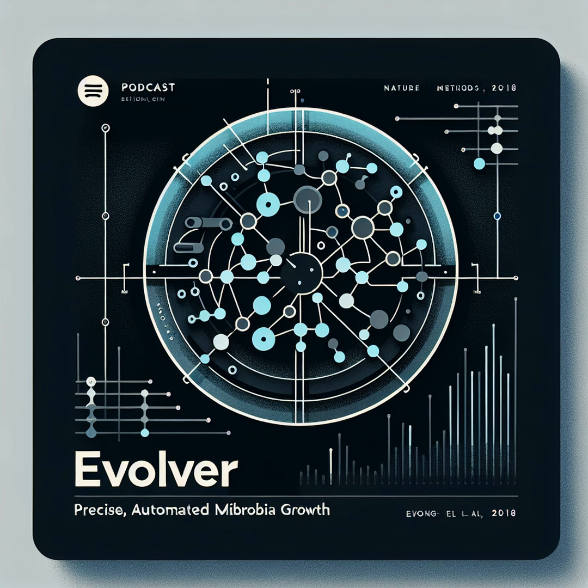And the fluidic module? How does that work alongside the smart sleeves? The fluidic module handles the liquid handling, adding fresh media, removing waste, and performing dilutions. They use two different approaches: a simpler peristaltic pumping system for basic tasks, and more sophisticated millifluidic multiplexing for more complex fluidic manipulations. Millifluidic multiplexing sounds advanced. What exactly does it entail?